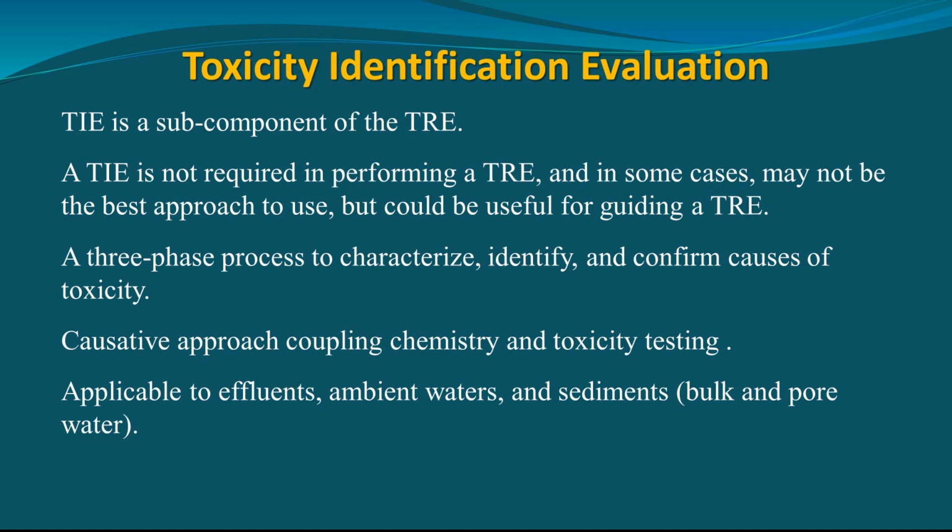And so a TIE is specified in EPA's documents, and they're for both freshwater and marine, aquatic samples and sediment. They have all these guidance documents for TIE procedures, and plus there's a whole body of literature surrounding these, and these are all available. They're divided into 3 phases, and the phases are characterization, identification, and confirmation. Sometimes they're interchangeable. Sometimes characterization and identification are included in the same experiments, but I'll lay out what those are.